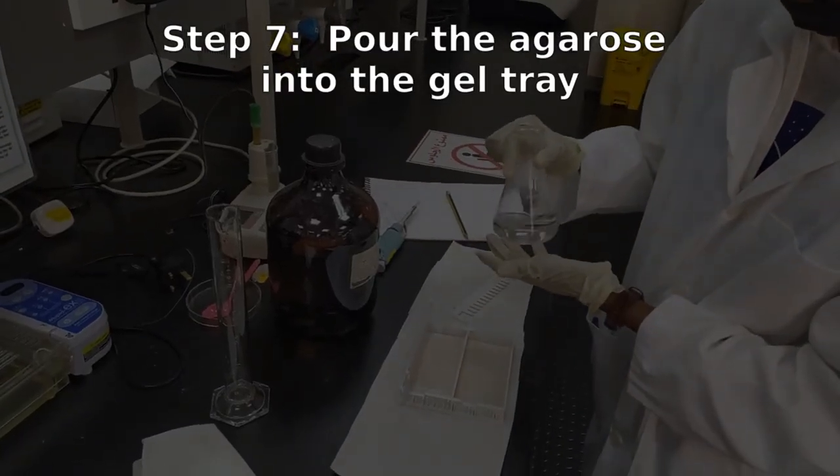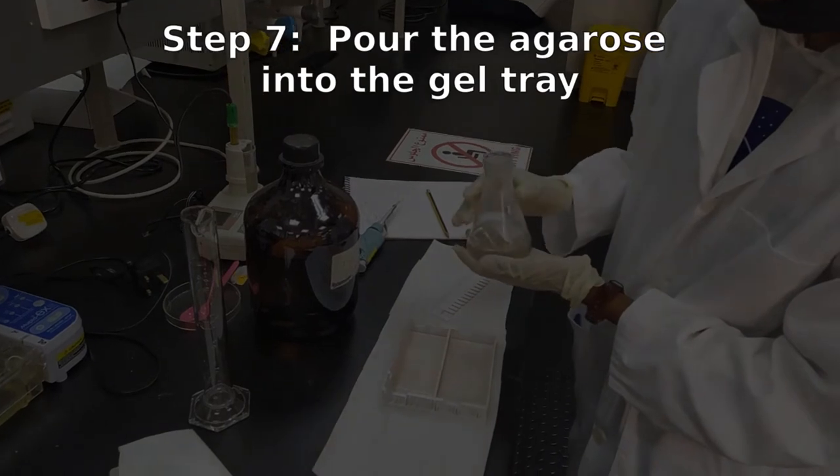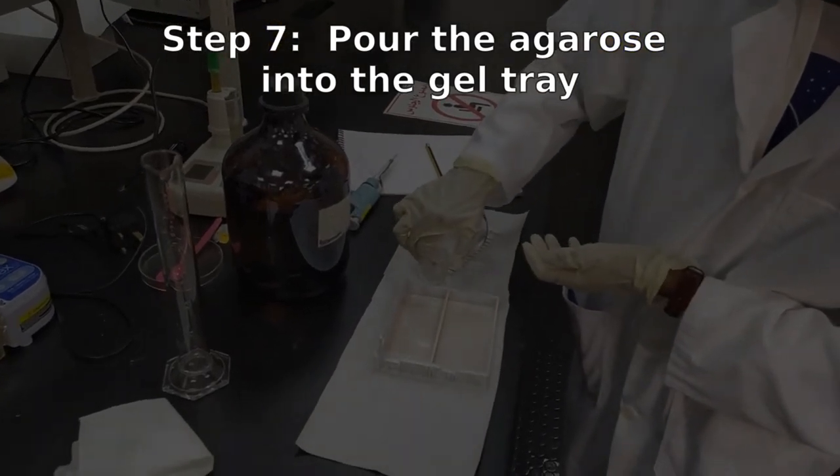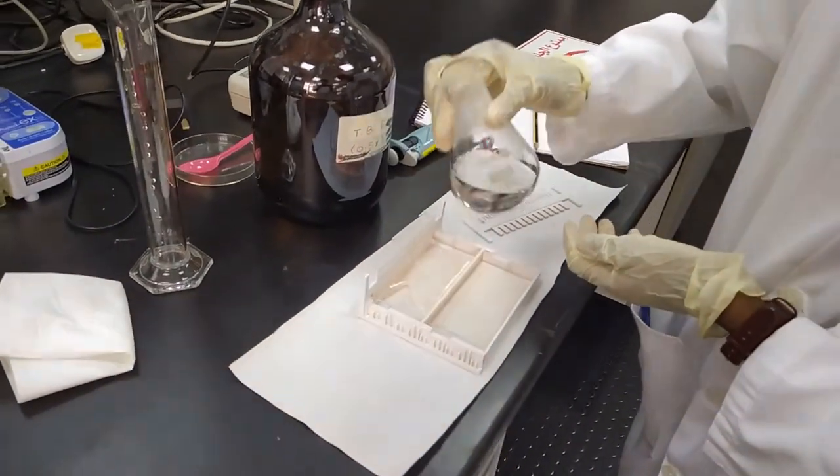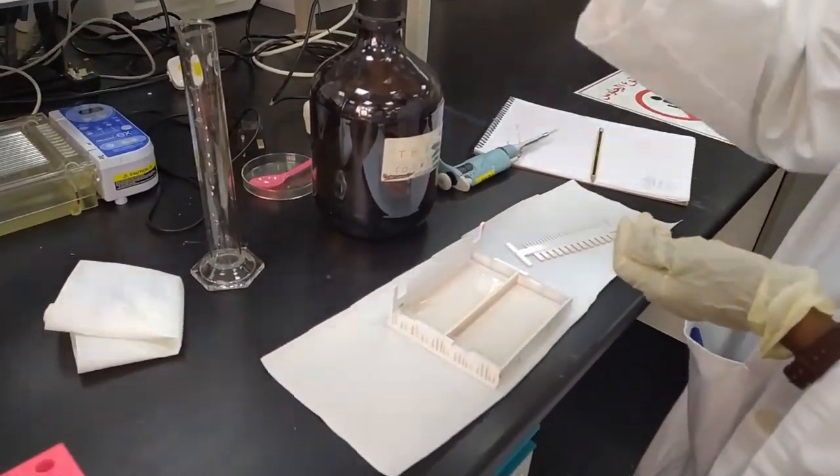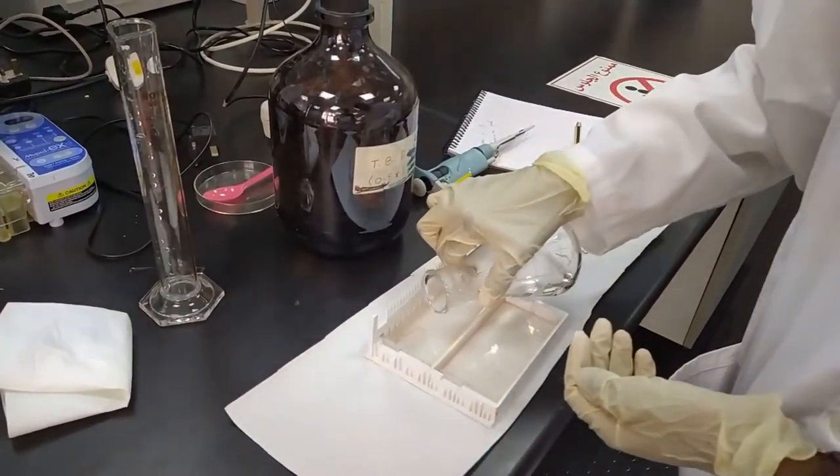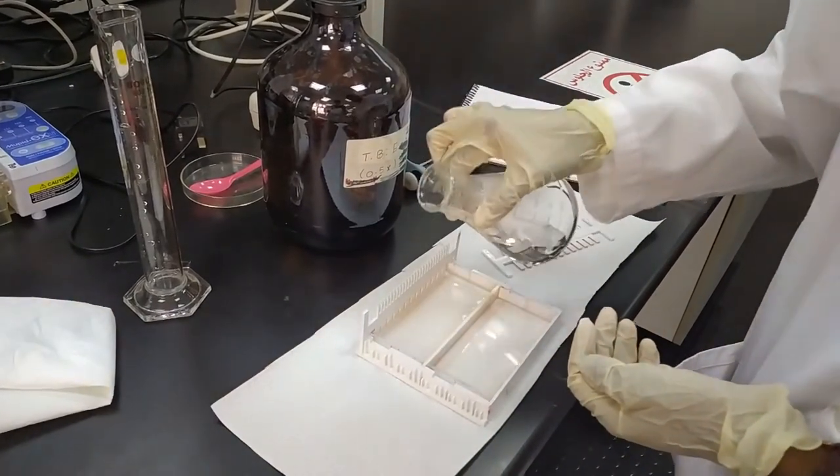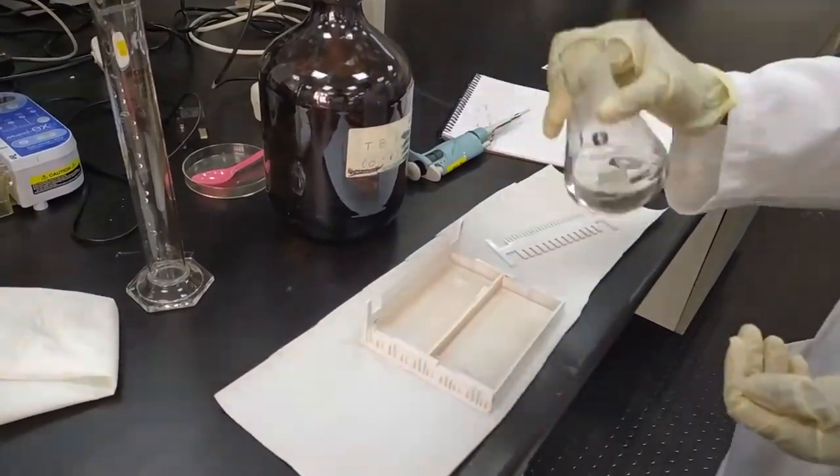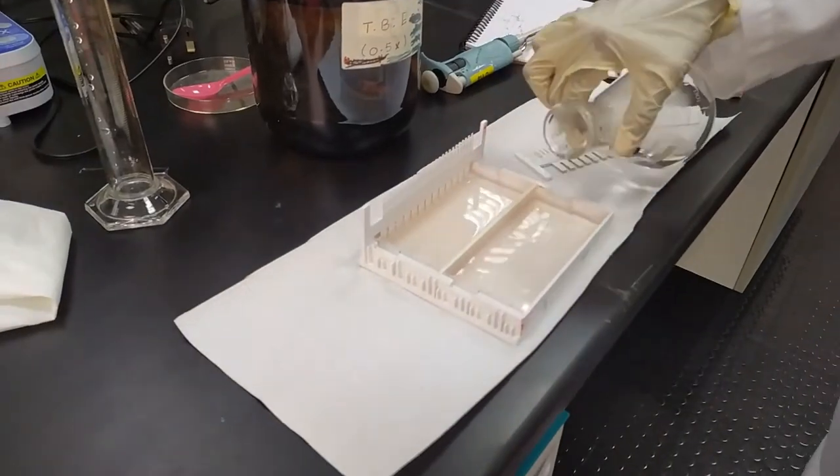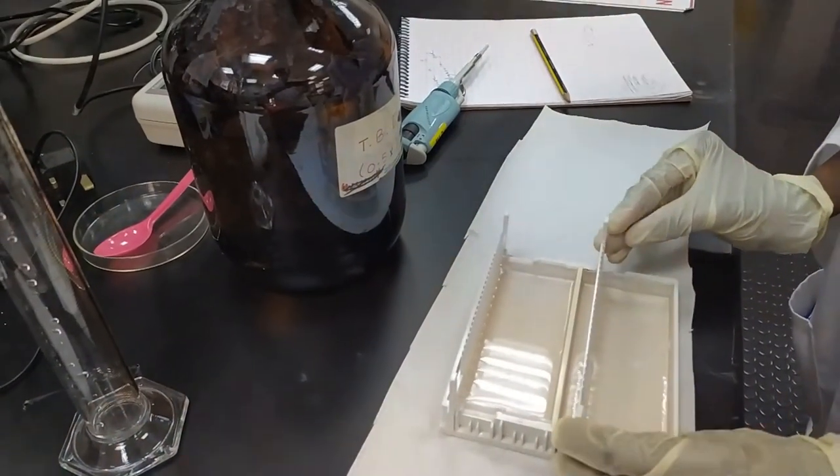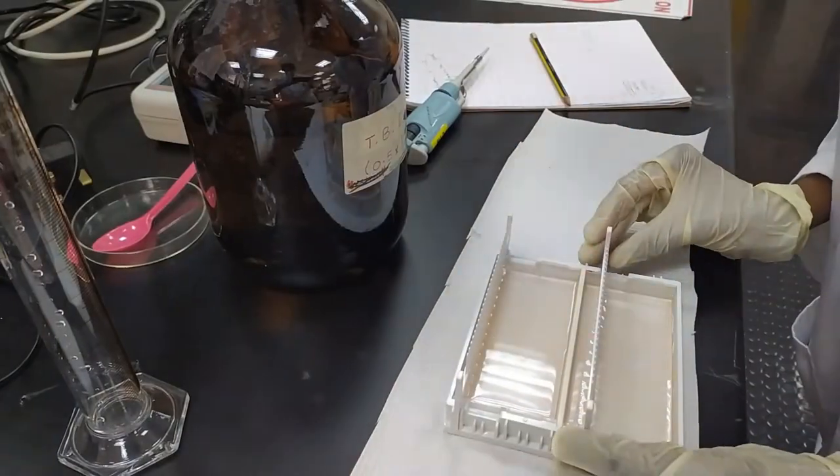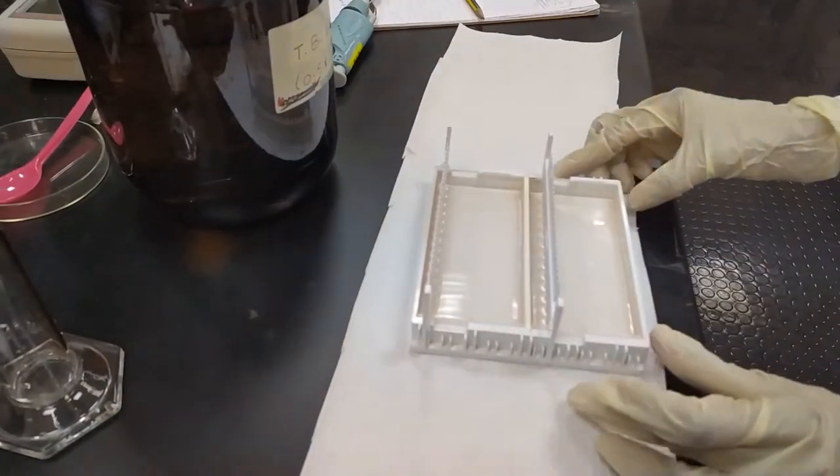So, in this case here, we will be pouring two gels. One of them already has the combs in place. So, you can pour the gel with the combs already in place. It's simply going to go around the combs and it's going to set. Or you can pour the agarose first and insert the combs afterwards. The key here is to make sure that the gel comb is in nice and straight so that you have a good starting point for your DNA to migrate.